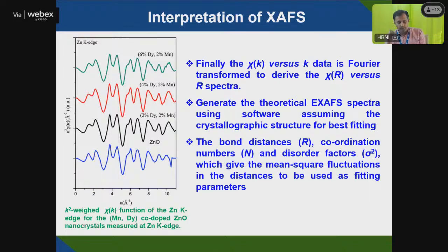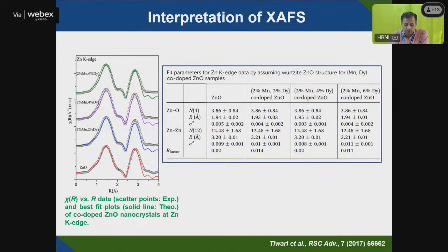You can get all this information; I have given just one example. This is zinc oxide with manganese doping, with zinc and oxygen, and zinc. You can see here the zinc-oxygen bond length. This peak is mainly due to the zinc-oxygen ZnO peak, and then the zinc peak. You will get other information, that there is another peak here, that also shows how manganese doping is changing the bond length.